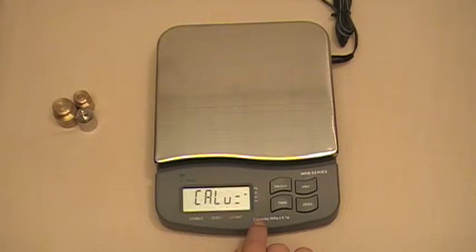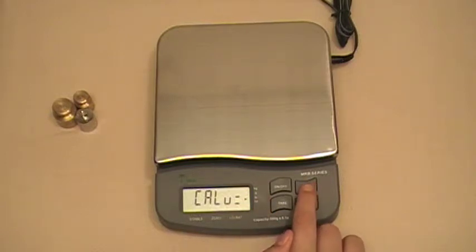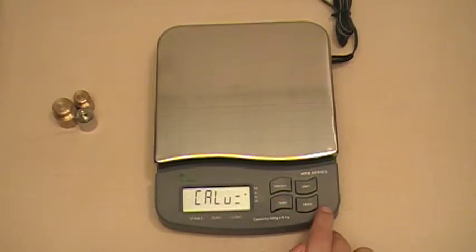You can either calibrate using grams or pounds. Right now it's on grams. To change that, press the unit button to switch to pounds, then back to grams. Once you've selected the measure you're going to use, press the zero button.